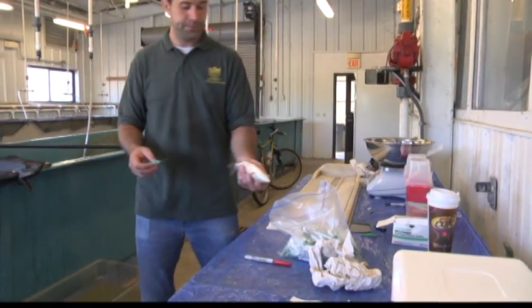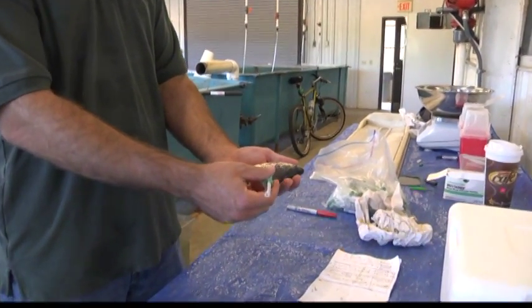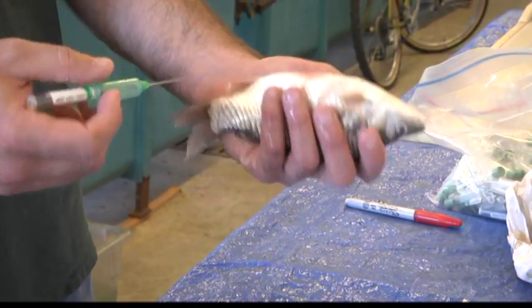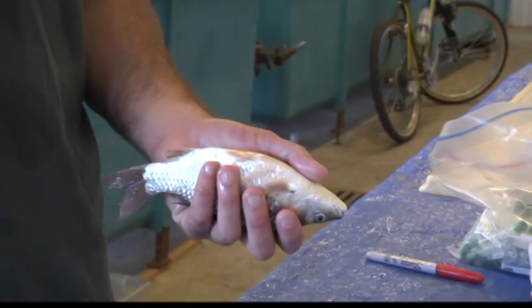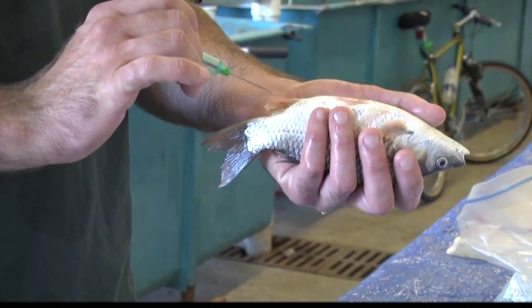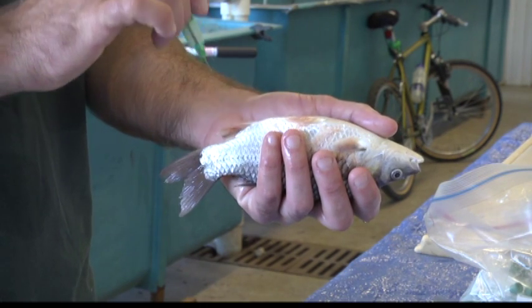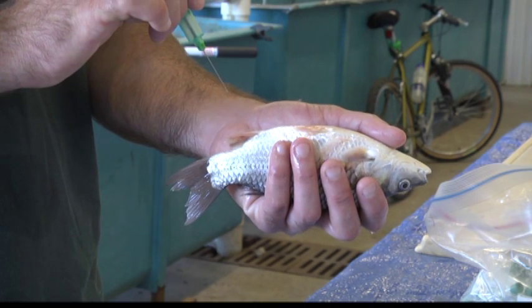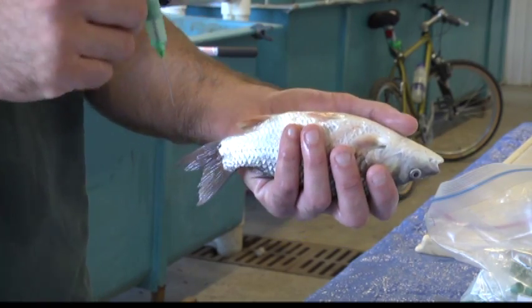When we draw blood, we're aiming for the caudal vein. The spine of the fish runs along the lateral line, and the caudal vein runs on the ventral side of the spine. So we're going to go into the fish on the ventral side in the caudal peduncle. There's an angle to the needle — it helps if you keep that angle going with the fish until you get under the scales. Once you're under the scales, you want to tip the needle up and go straight down until you feel the vertebrae. Once you feel the vertebrae, back the needle up just slightly and then push the vacutainer down, and hopefully you'll start drawing blood out.